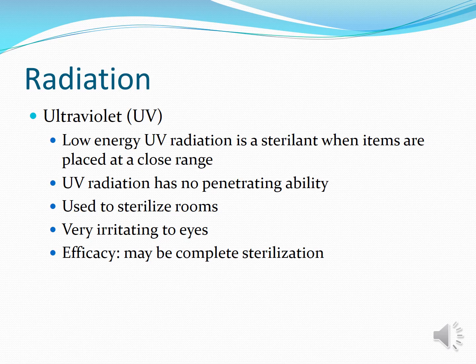Next is ultraviolet. Low energy ultraviolet radiation is a sterilant when the objects or the items are placed in close range. UV radiation has no penetrating ability, so it is used to sterilize the rooms. UV is very irritating to the eye. There might be complete sterilization possible there.